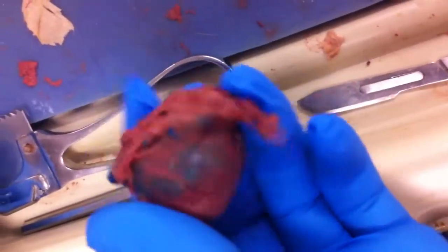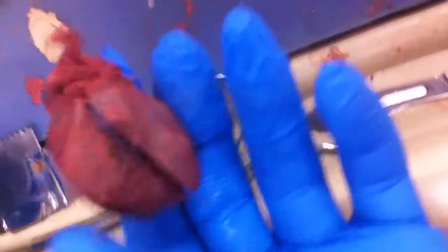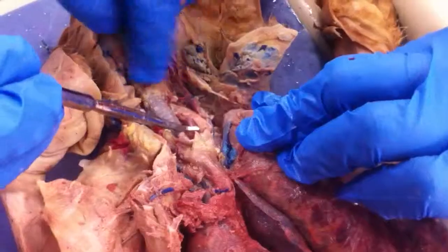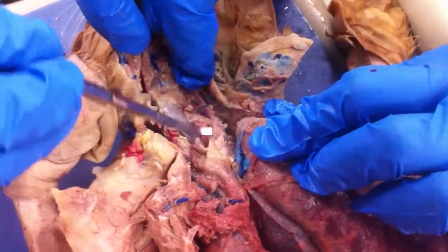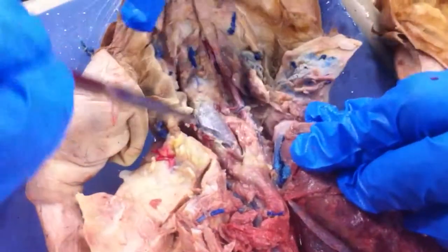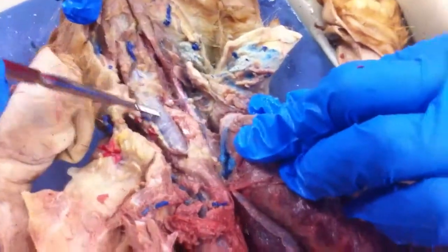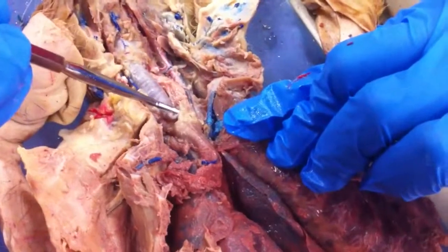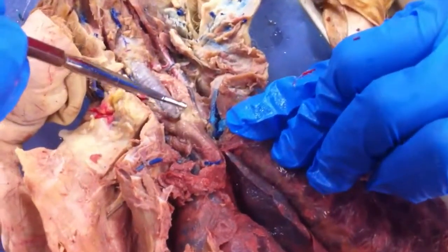At the top of it, and there we go. This right here is the esophagus. It's located right next to the trachea, which is that. And we've got a gland down here, which is the thyroid, I believe.